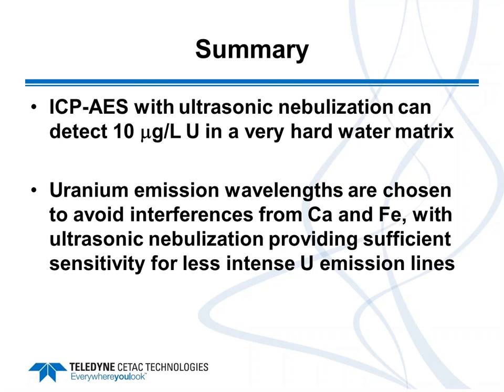If deposits do build up in there and they are part of the analyte mix you want to look at, that's something to always monitor. In the Tygon line, yes, it can occur. Typically, I recommend keeping the line as short as possible, and certainly you can move to Teflon or an FEP line so things don't stick as readily.